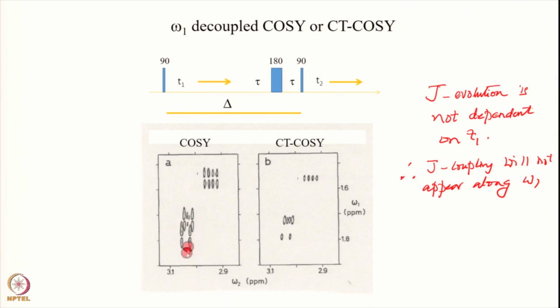There is one here and another here, slightly shifted along the omega 2 axis. This one is to the left compared to this one, but there is an overlap. This overlap can cause cancellations of the intensities of the peaks, which indeed has happened.